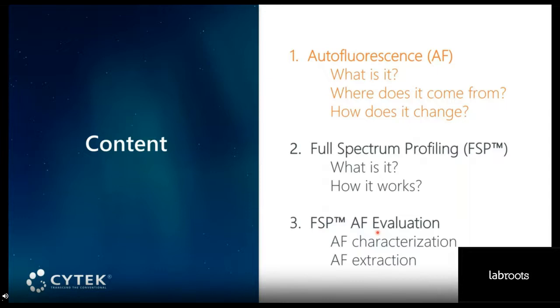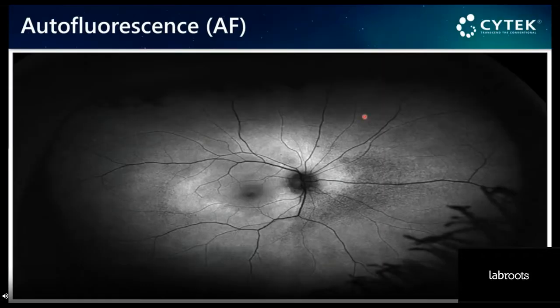It's noise, baseline signal that is just coming from unstained cells. All that natural emission of fluorescent light that's coming from biological structure within the cells in your sample. And the ability to capture autofluorescence has been used in multiple fields, including clinical applications, because changes in autofluorescence can also serve as diagnostic indicators.